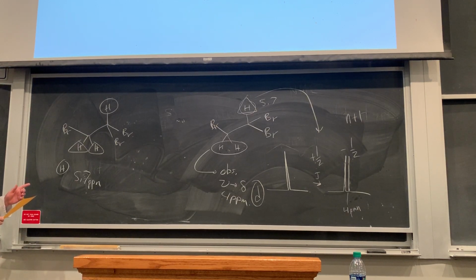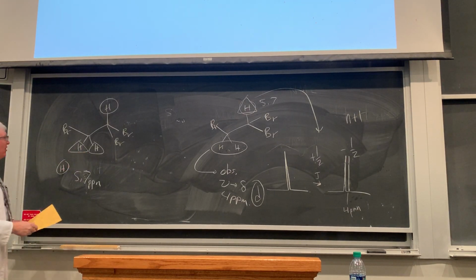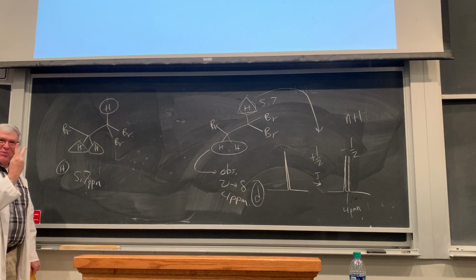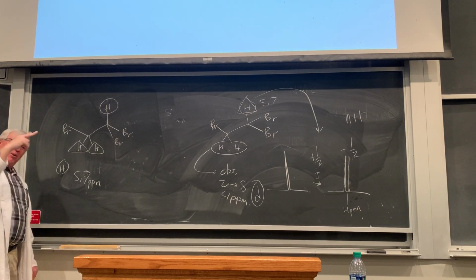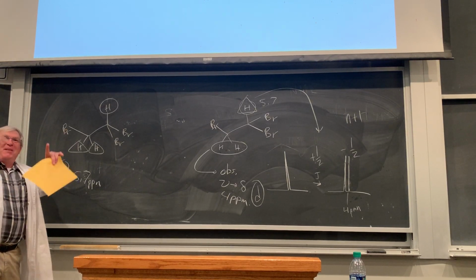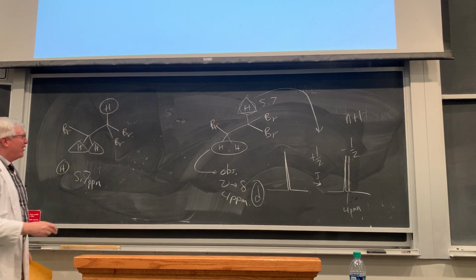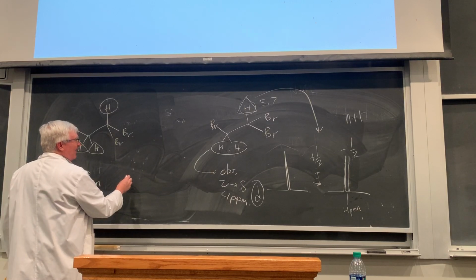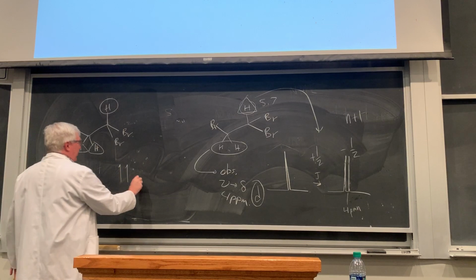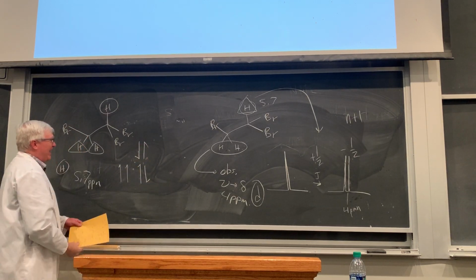Well, instead of being a singlet, it's going to see two different spin states. Now, how can we arrange those two spin states? Well, we can have two of them be +1/2, both lined up, or two of them both down, or one up, one down, or the other one up and the other one down. There's two different ways to have one up, one down. These spin states are kind of fun to keep track of. Let's see, if we have spin up, that's one way to do it. But we can also have spin up, spin down, or spin down, spin up, okay?